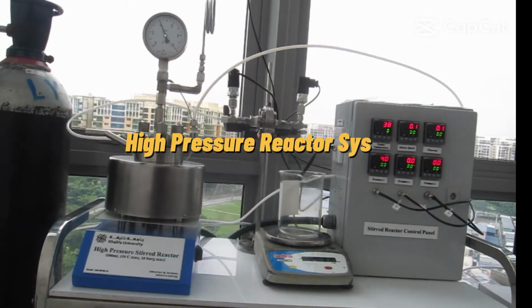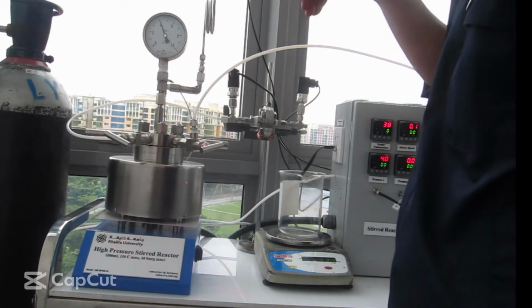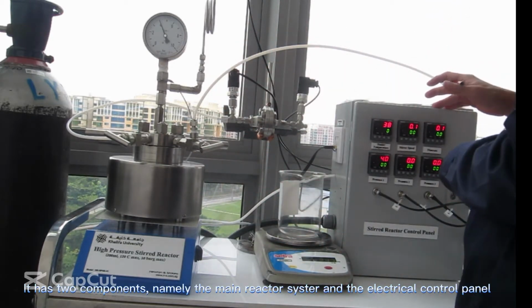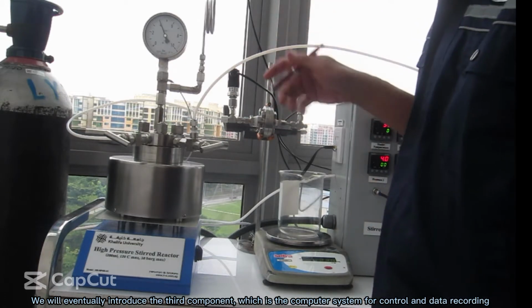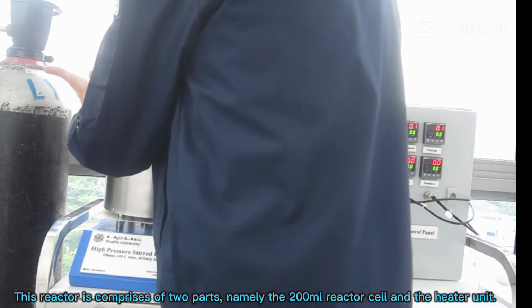High-pressure reactor system, fully customized control. Hi, a very warm welcome to all users of this high-pressure reactor and membrane separation system. It has two components, namely the main reactor system and the electrical control panel. We will eventually introduce the third component, which is the computer system for control and data recording.